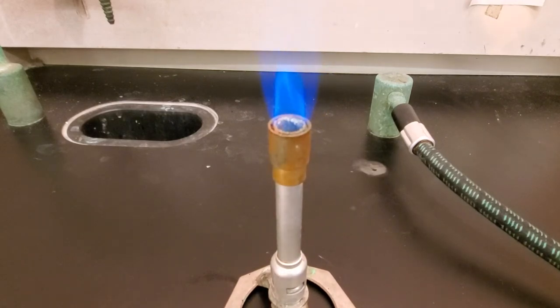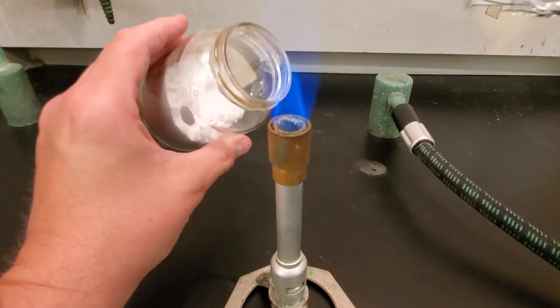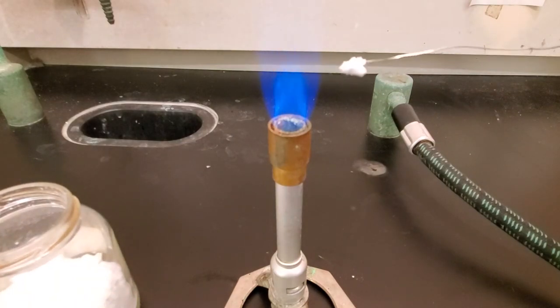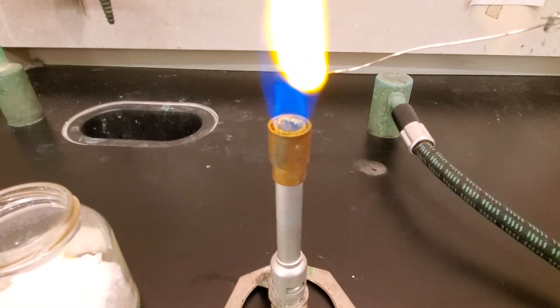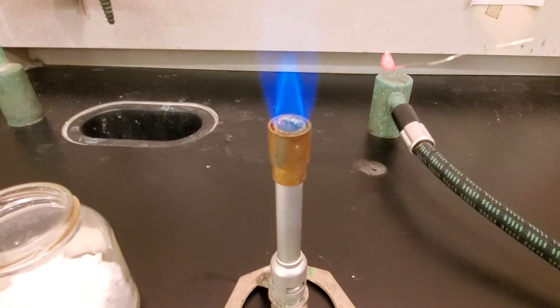We're going to take our wire, heat it until it's red hot, and then dip it right into the borax powder. You can see we've got borax covering it, and we're going to put it back in the flame to get that borax to melt into the loop. It's a little hard to see in the video, but that borax is melting. What you're going for is a nice glassy bead — you can see there that the borax melted into a relatively clear, glassy-like material.